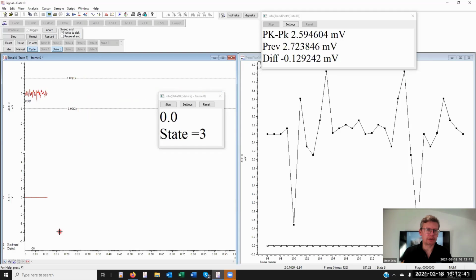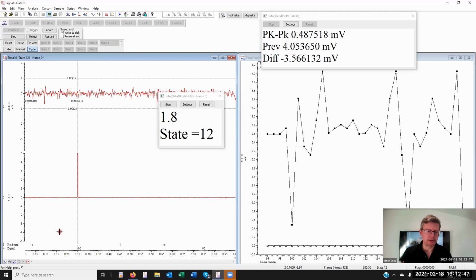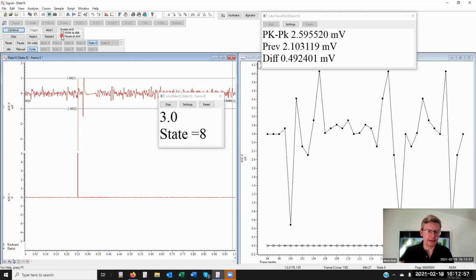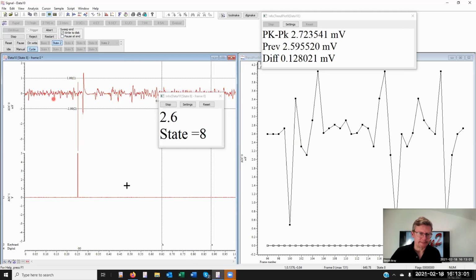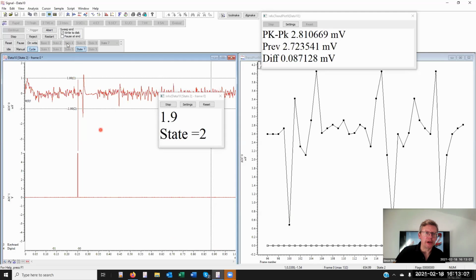Okay, so I'll just wait. Okay, HELLO, HELLO, HELLO. So I'm just trying to type. Right, now you see that I'm failing to get anything. Yes, but these keyboard markers are widely spaced. I'm trying to spell out hello there in the keyboard channel.